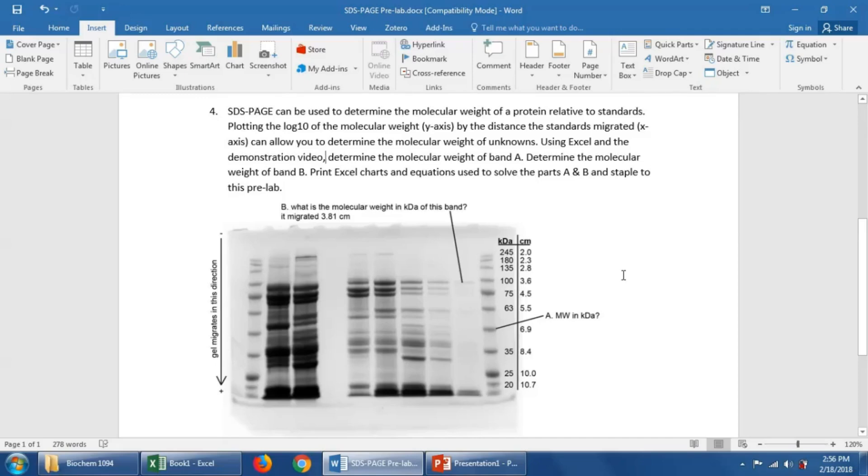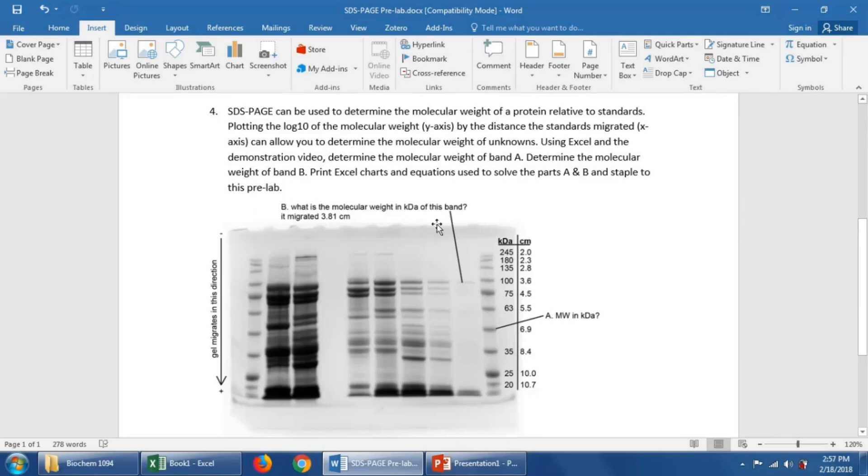SDS-PAGE can be used to determine the molecular weight of a protein relative to standards. Shown here is a typical SDS-PAGE gel after it has been run and stained.